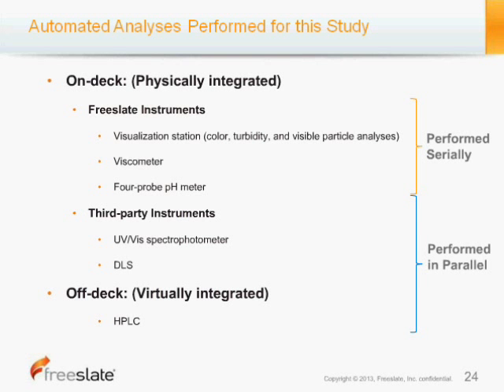And then as far as your third-party analytics, once you aliquot the material out that you need for analysis, those can all be performed in parallel. It depends on how many plates you want to use and how many different instruments you have, but basically you can create 3 or 4 plates and run all 4 of those plates at the same time. So these are just giving you some idea of the flexibility and the architecture of how to plan some of these studies.